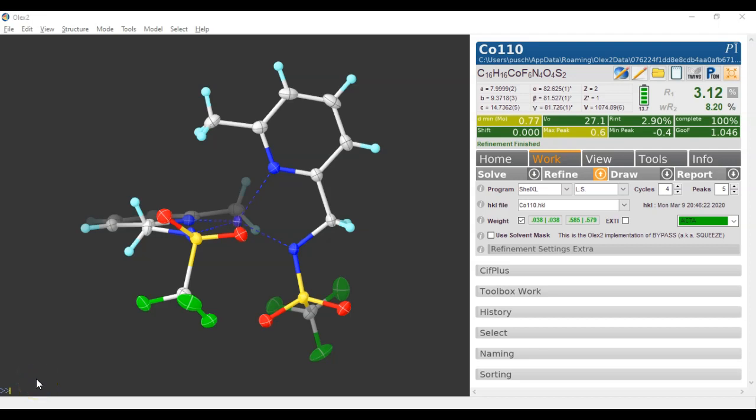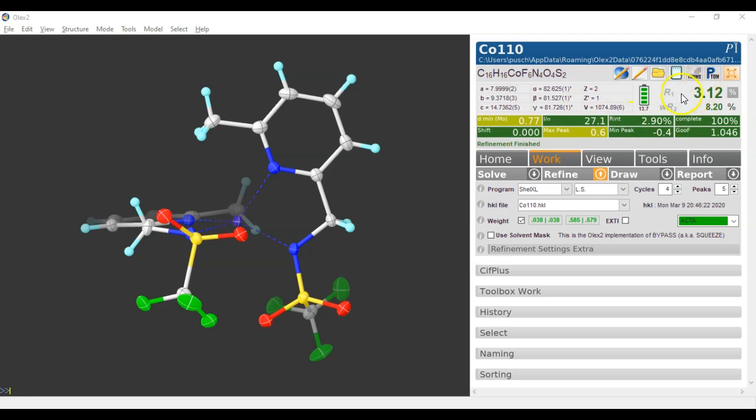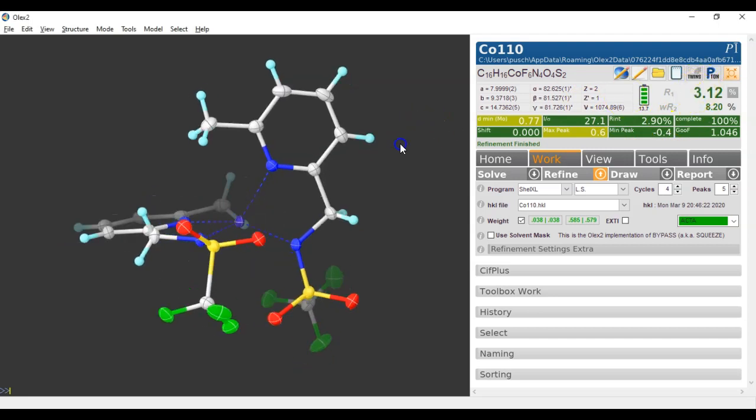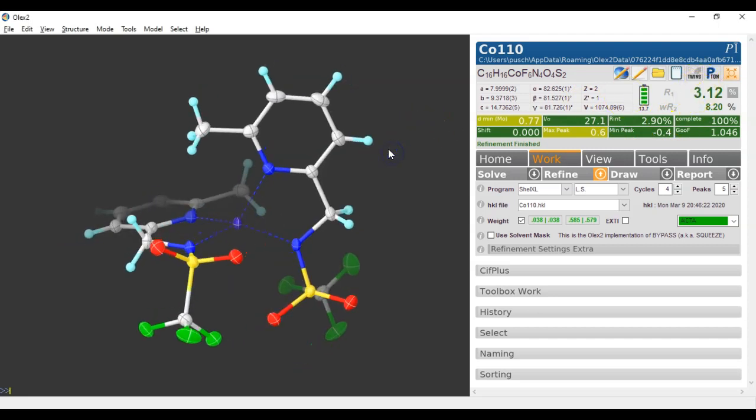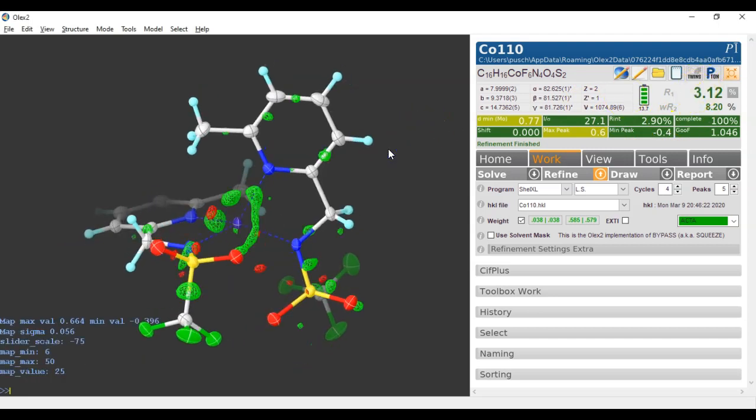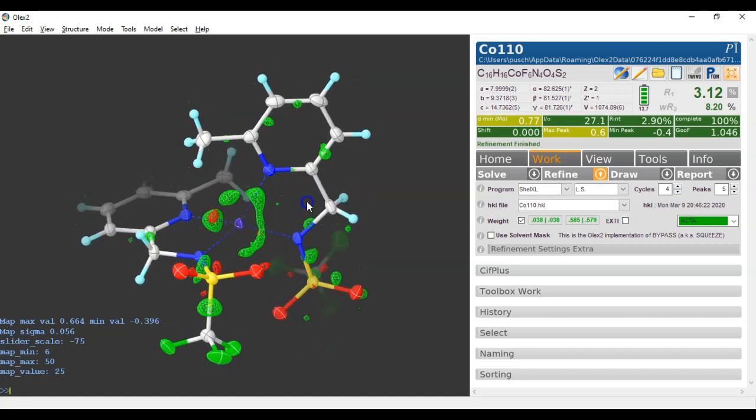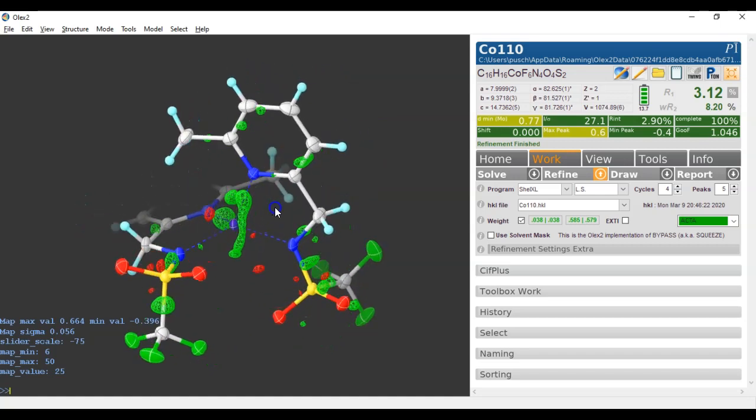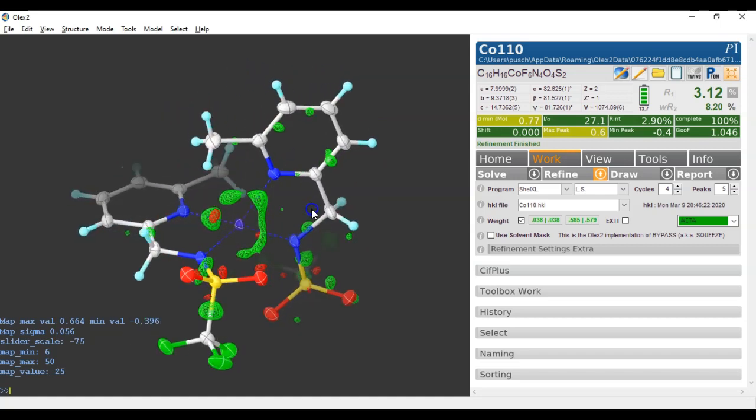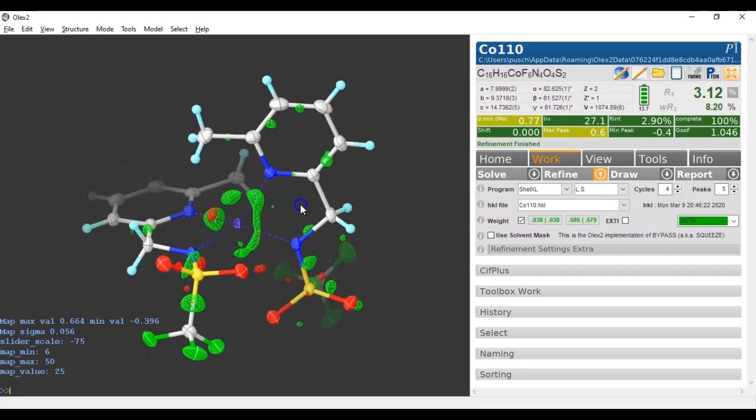Here's a preview of the latest feature of Olex 2 Refine. This is the structure. It's finished with ShelXL least squares and we get an R-factor of 3.12%, and CTRL-M shows us the residual electron density map as you would expect it to be for a compound of this type.